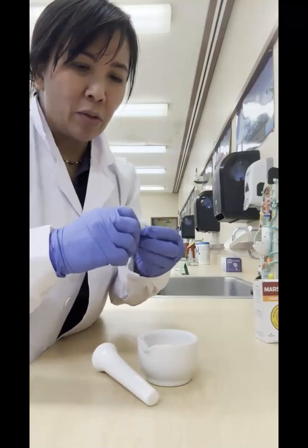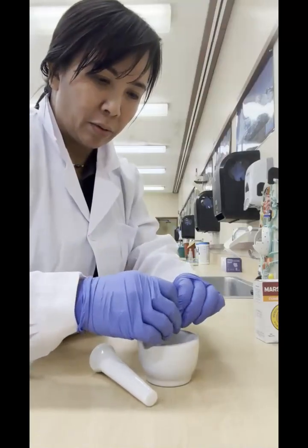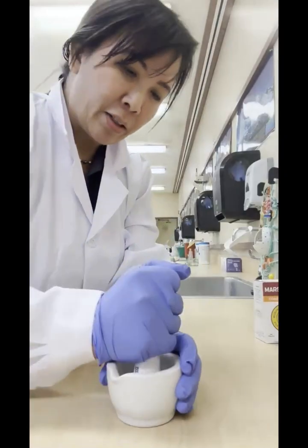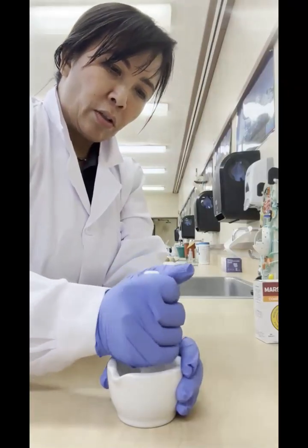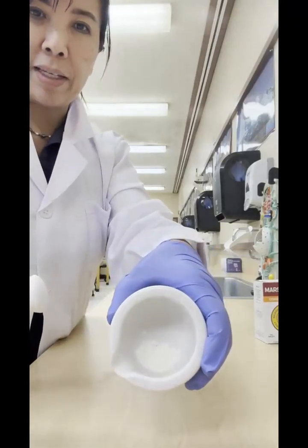What you're going to do is place it in our mortar and pestle, and we're just going to grind it up. So you can see it start off like that. You're just going to grind it until you get a powder like that.